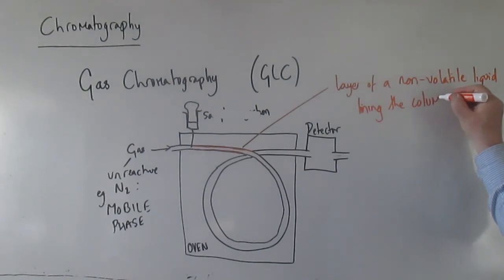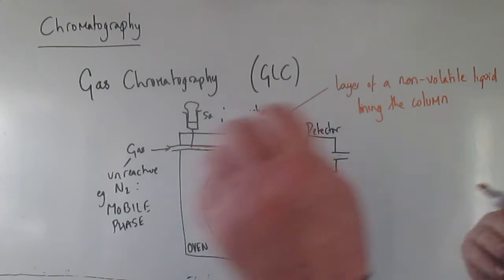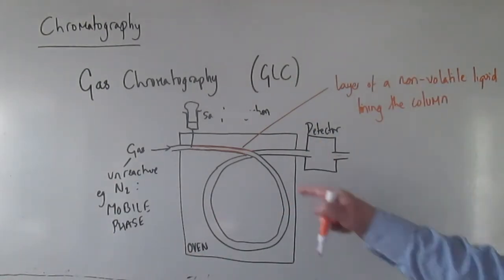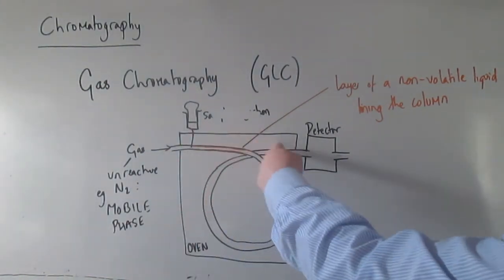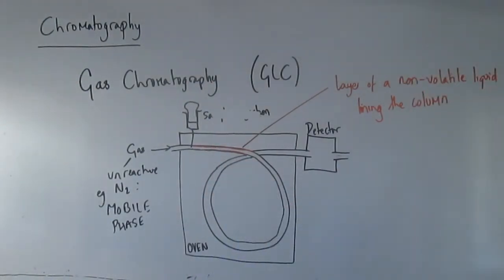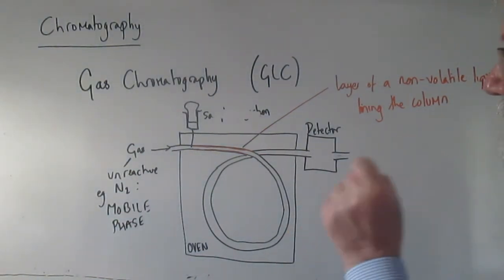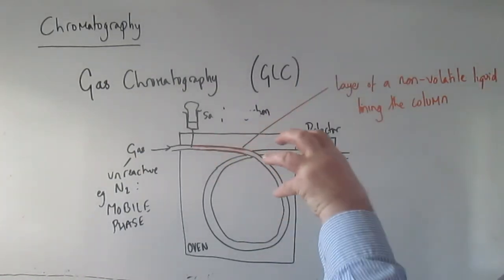And that's the crucial thing, because you can picture that as our substances go through the column, they're going to be constantly moving around in random directions, and if they hit the layer of liquid on the outside, there is a possibility that they will dissolve. Depending how soluble they are in that liquid, they will stay there for various lengths of time. Eventually, they will always vaporize again, and then they'll get carried further through the column. But every time one of these molecules of the substances you're analysing dissolves, that stops it in its tracks, because the liquid isn't moving. So while it's dissolved, it stays stationary.